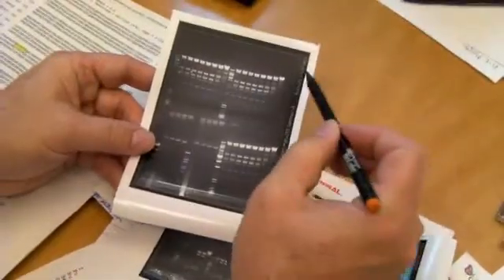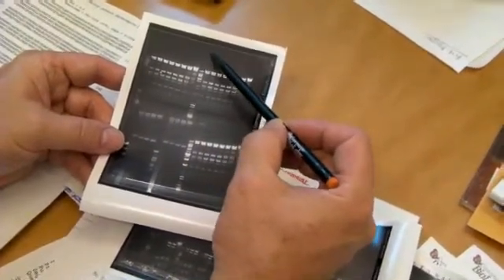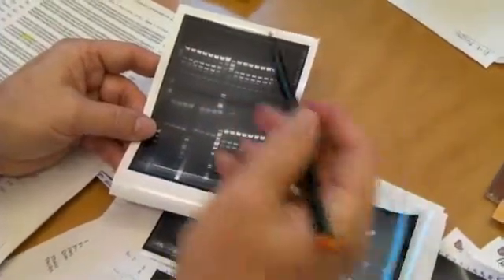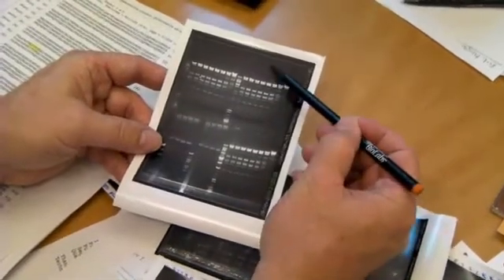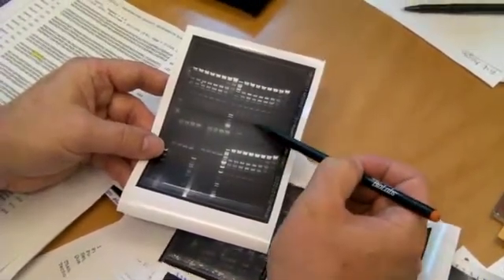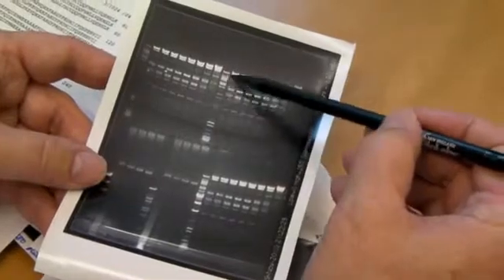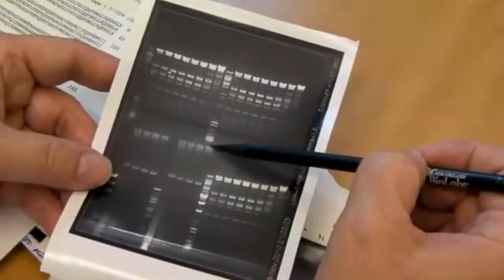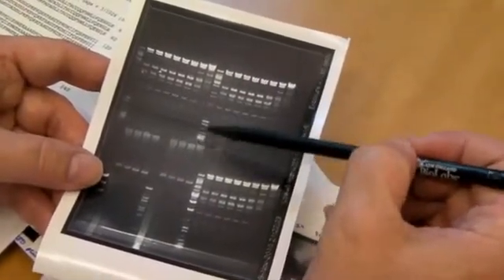This is a picture of an agarose gel. You can see up here there are the wells or the holes in the gel, and I've put the DNA solution into these, which sit down into the gel, and then run a current from the top to the bottom. The DNA migrates through the agarose, and it's kind of like people. The small pieces of DNA can work their way through the gel much faster than the big pieces of DNA. So you separate things based on size. So these are the largest pieces. They've moved the shortest distance from here, and these are the smallest pieces. They've moved a significantly farther distance. In this case, this particular one here is a DNA size standard, so these are known pieces of DNA that I know the sizes of.